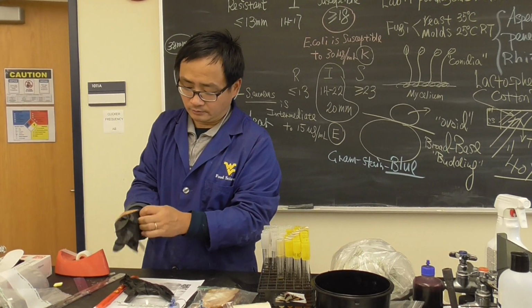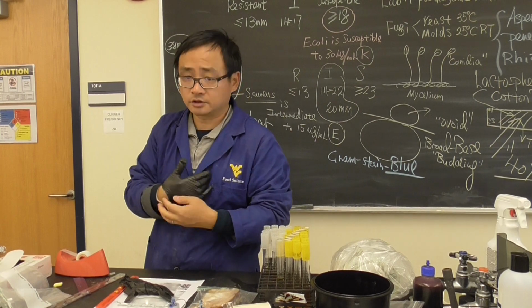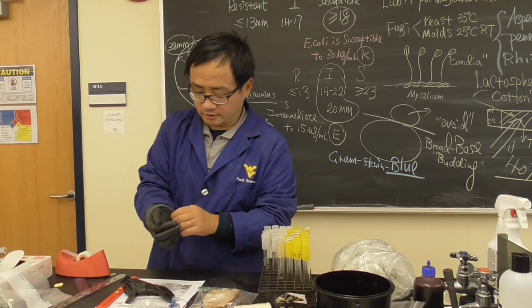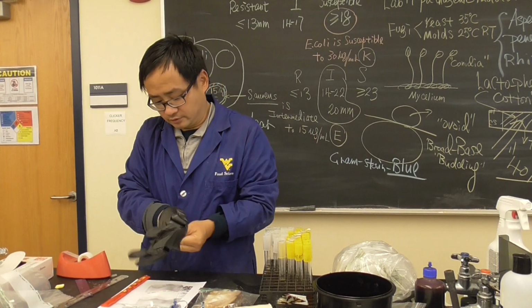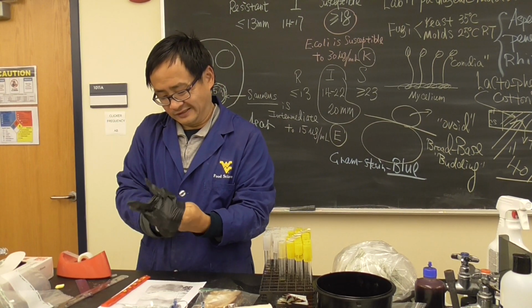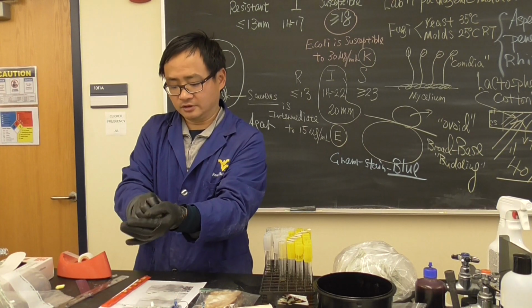Okay. Also, I think these are extras. Do you want me to just set them up here somewhere? Sure. In this one. Okay. So we have this. The glove is too small. It's too small. Let me see. It's not good.